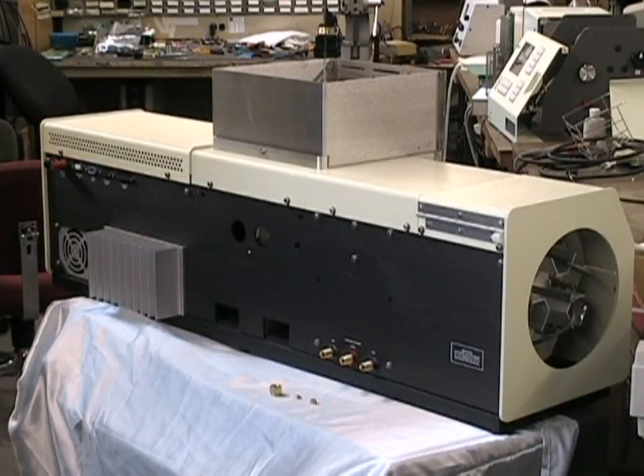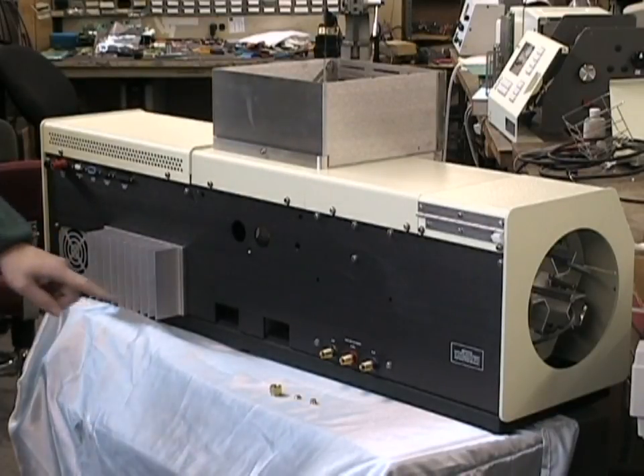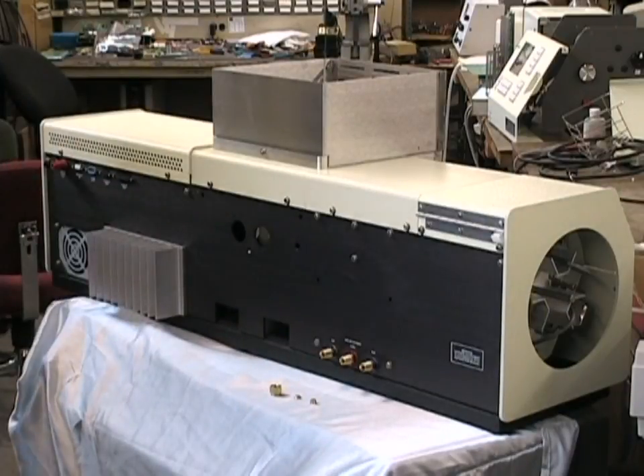The back of your model 205AA will have your connections for the electrical power supply and for your gas lines for air, acetylene, and nitrous oxide if used.